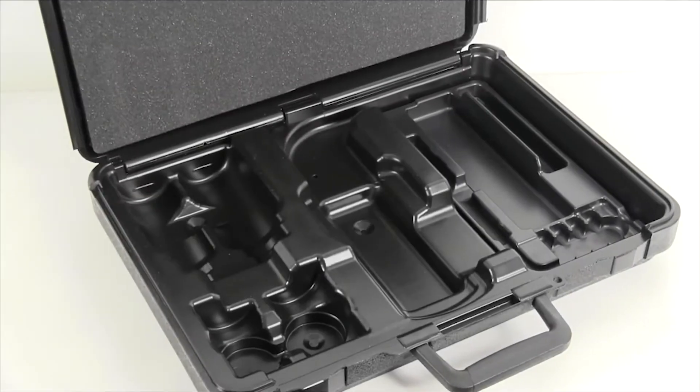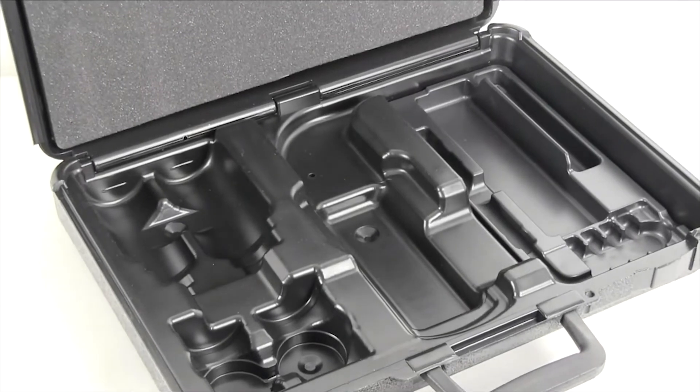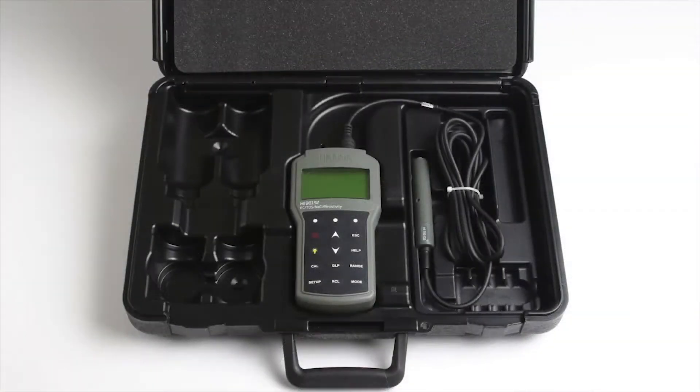The HI-98192 comes packaged in a rugged and heavy-duty carrying case that is thermoformed to secure the necessary components for routine measurements. In each case, along with your meter and probe, the following materials are supplied.